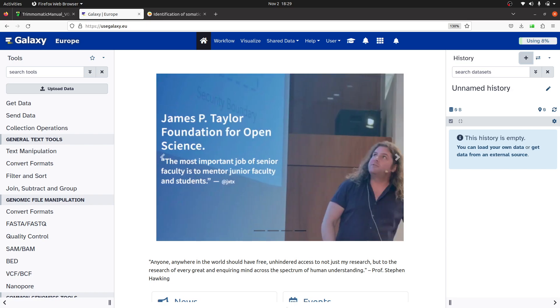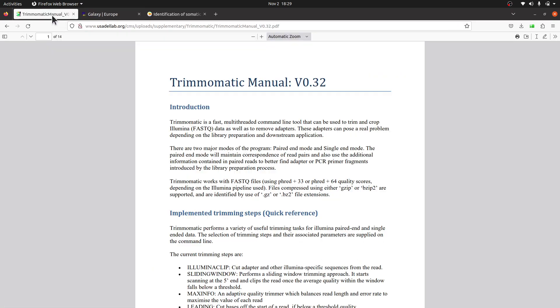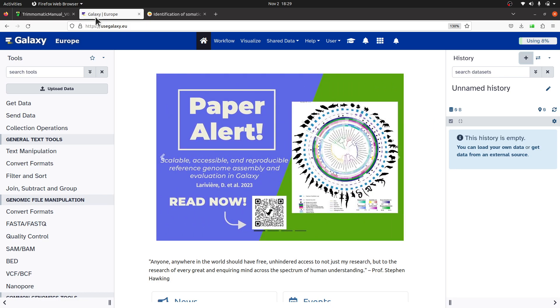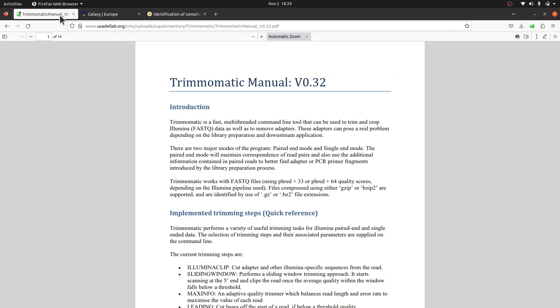Hi everyone, welcome to another episode of my Galaxy for Bioinformatics tutorials. In today's video I am going to show you how to run Trimmomatic on the Galaxy platform. For those who don't know, Trimmomatic is a tool that is used for trimming reads, both paired-end and single-end reads.